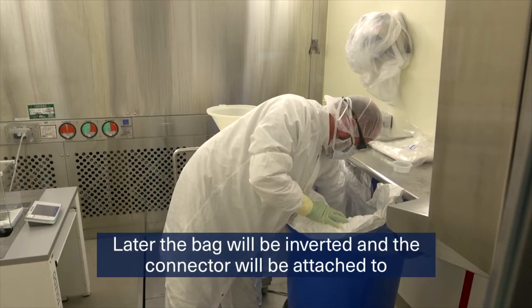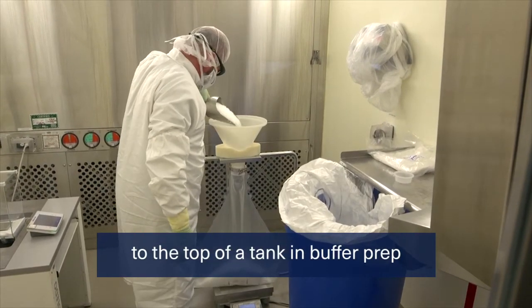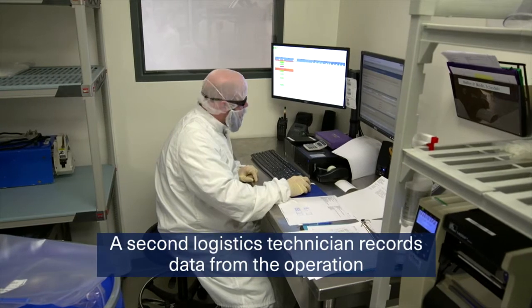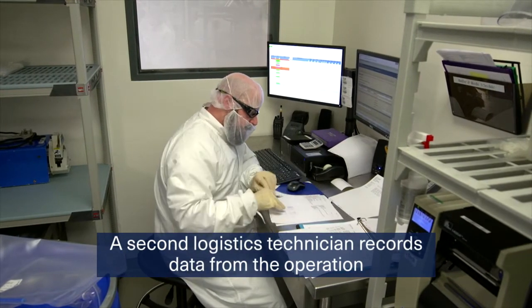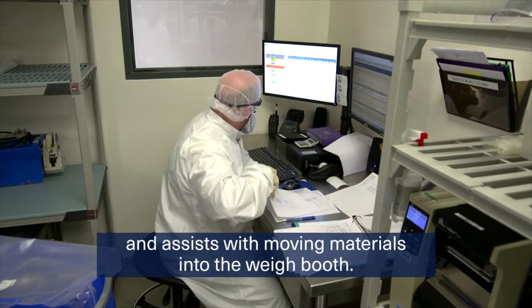Later, the bag will be inverted and the connector will be attached to the top of a tank in buffer prep. A second logistics technician records data from the operation and assists with moving materials into the weigh booth.